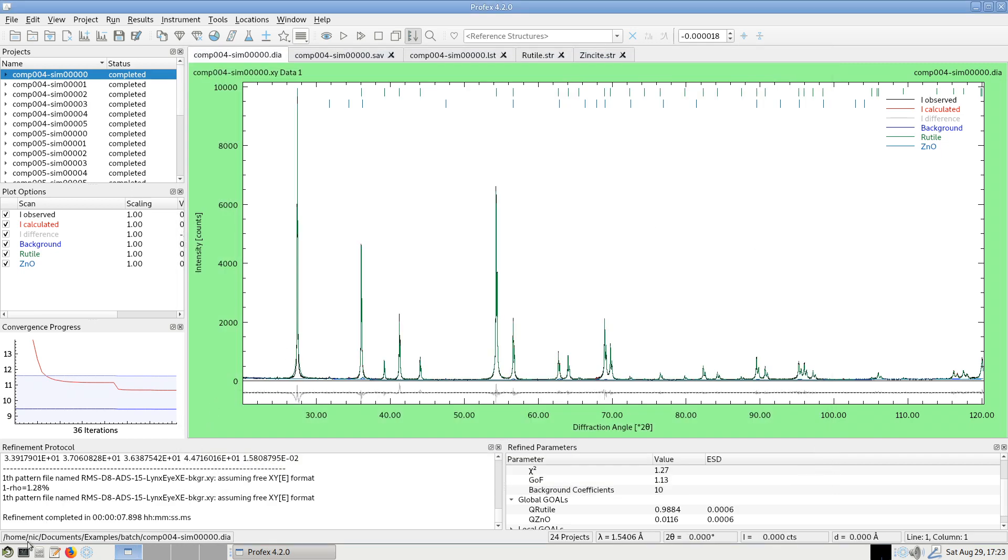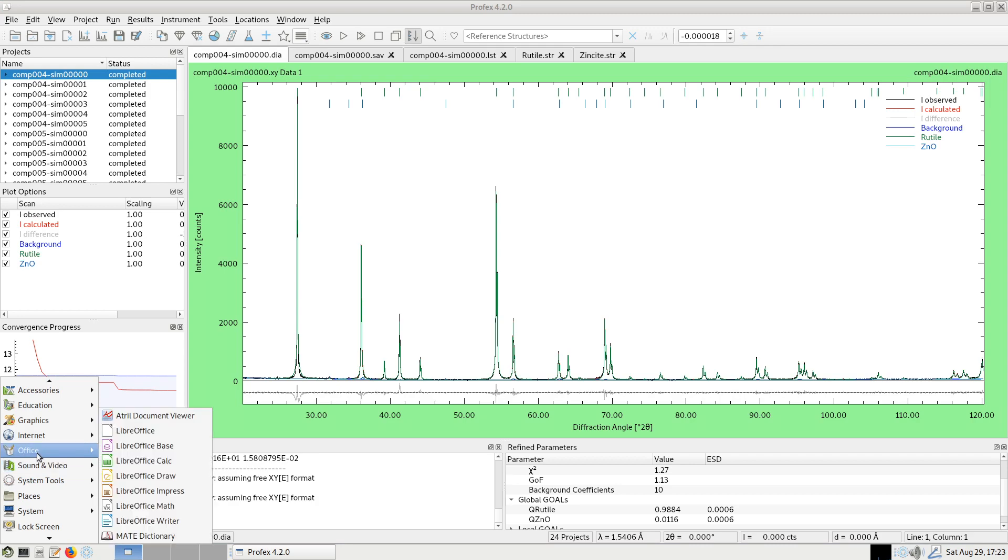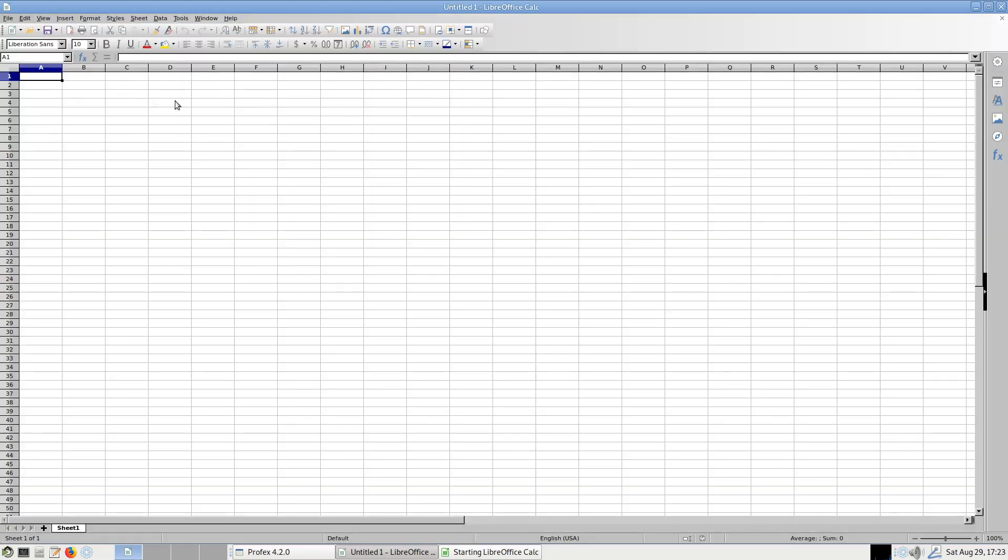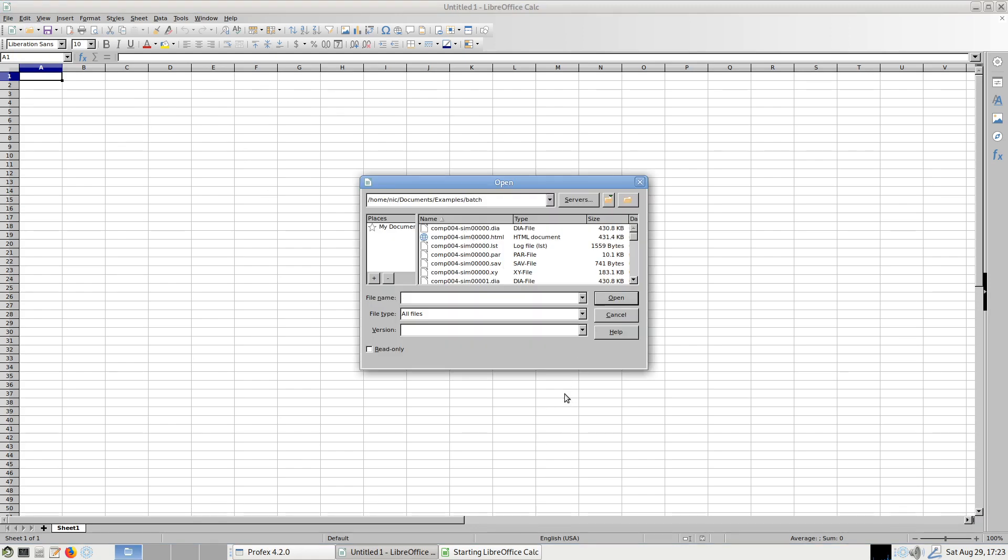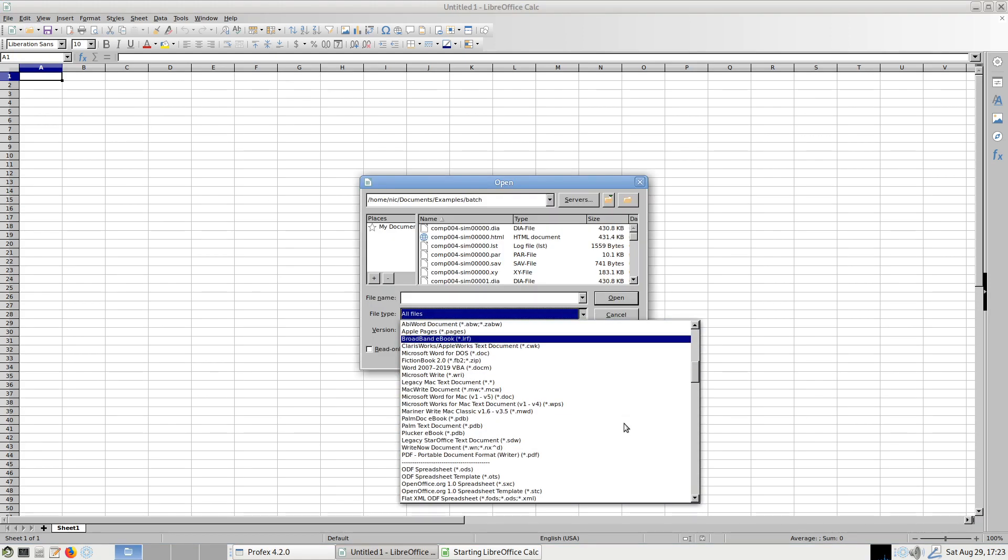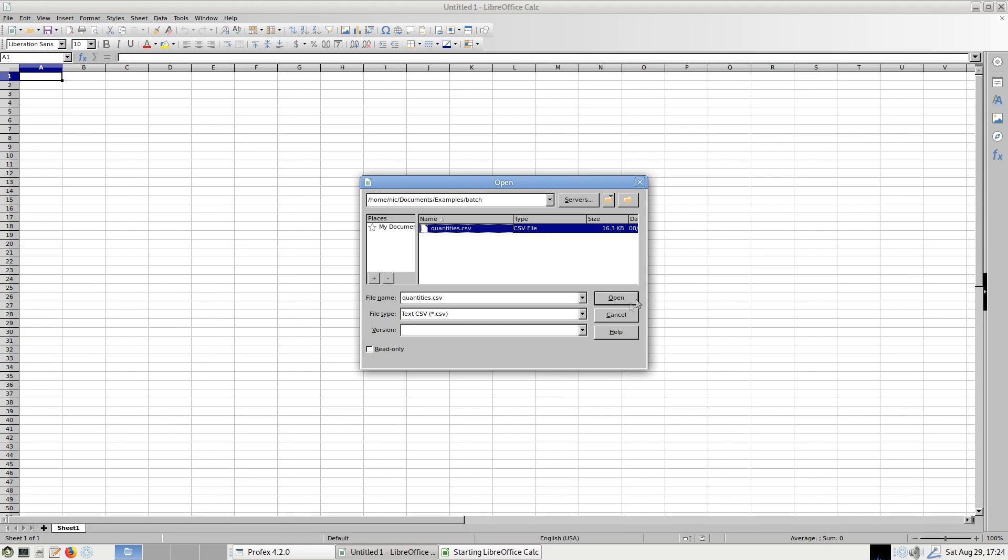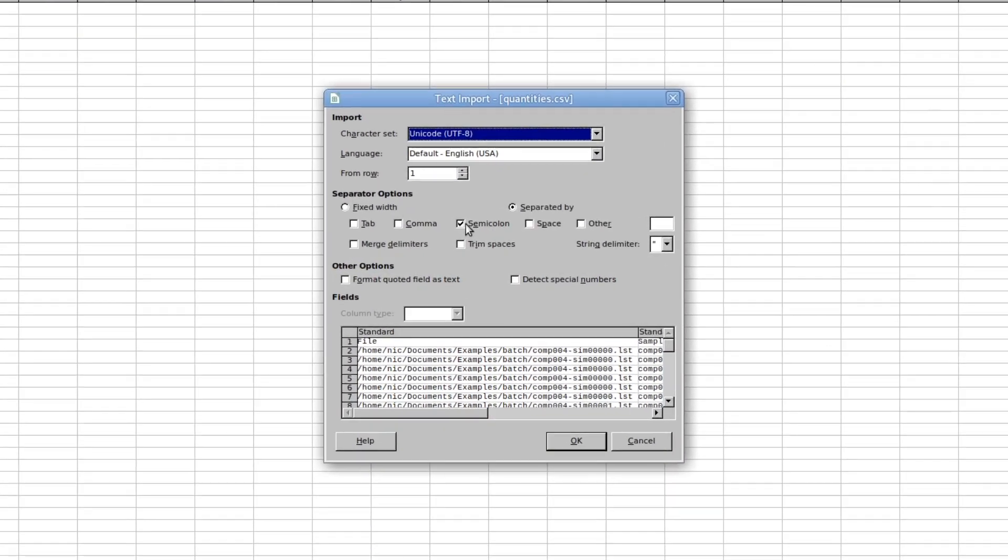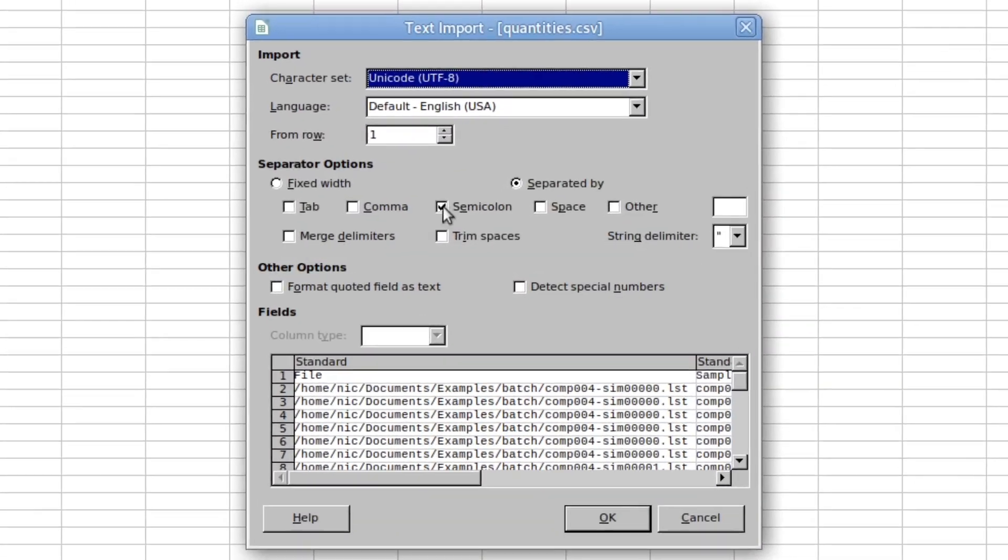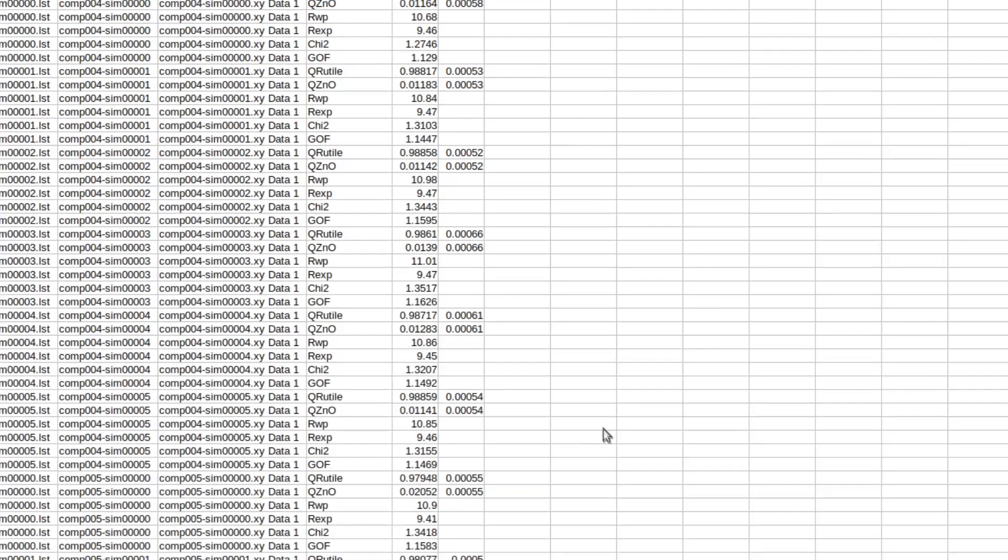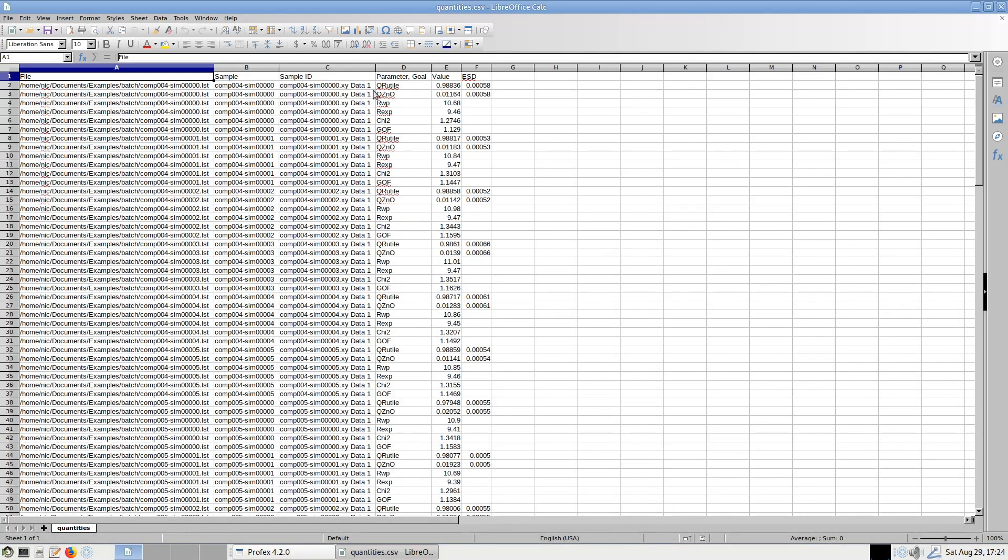And now I can open this file in a spreadsheet program, for example, in Microsoft Excel or LibreOffice Calc. Here's my file. And the field separator used by Profex export is the semicolon. So I deselect all others and only select the semicolon. Okay.